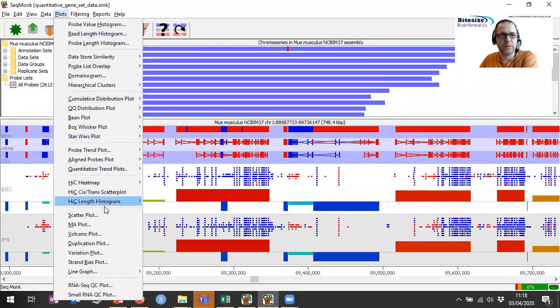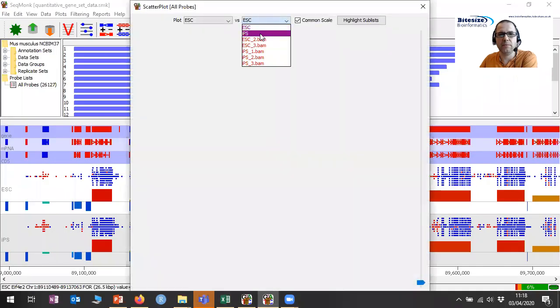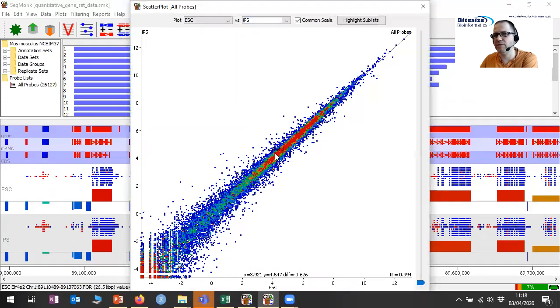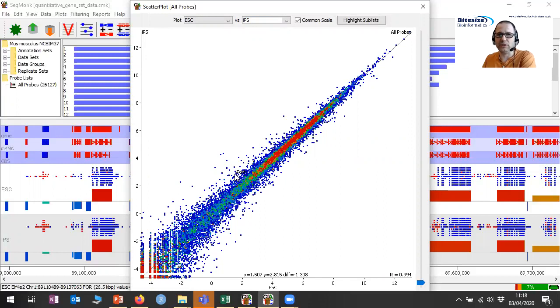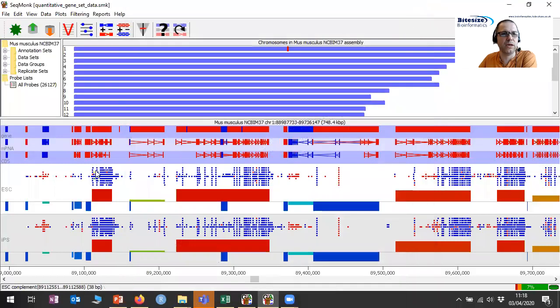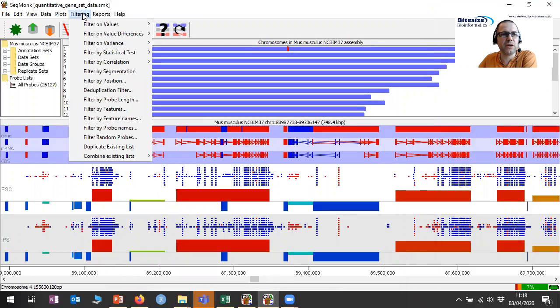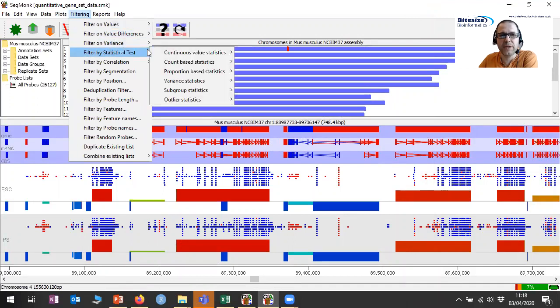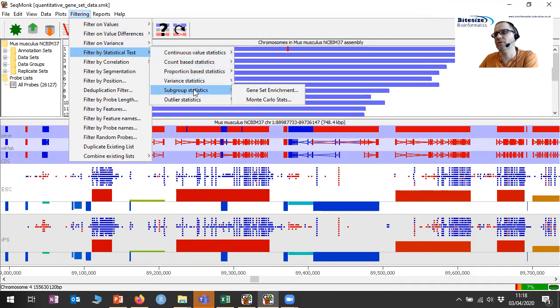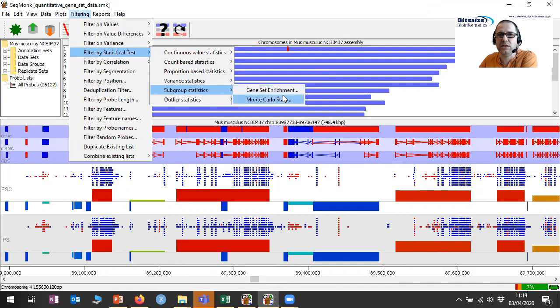So we have our dataset with a set of differences that we want to compare, and we now have a set of interesting gene sets that we want to test. Let's put those together and actually run the test. This is going to be under the filtering menu in SeekMonk — it's a statistical test, and it's a subgroup test because we're going to test how interesting a subset of probes — our genes — are going to be. We're going to do a gene set enrichment.